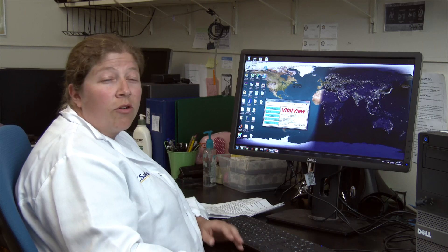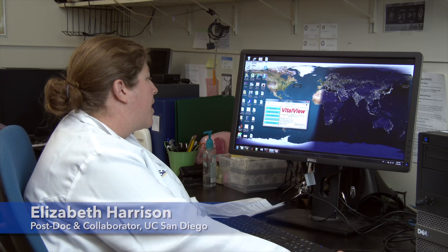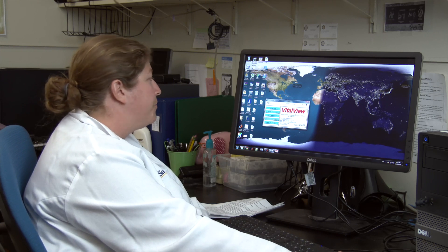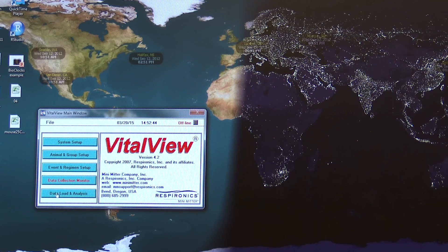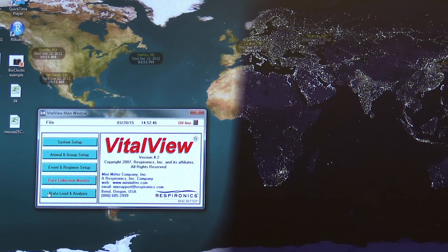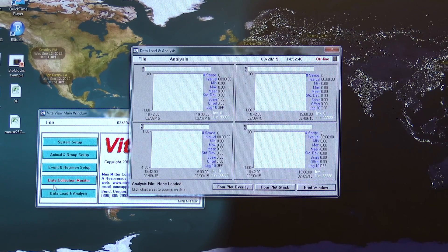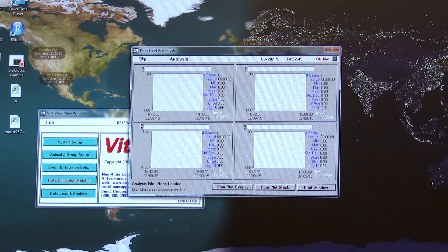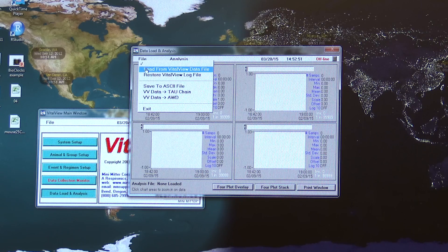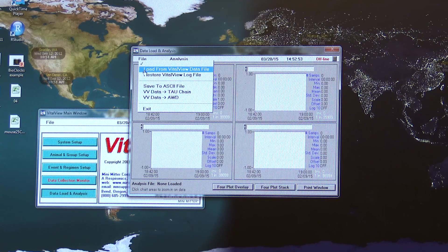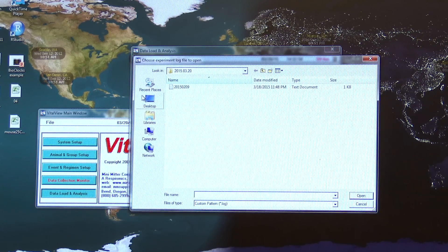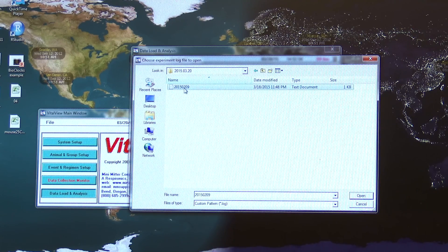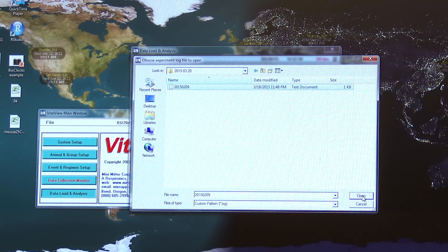In order to make an actogram of the animals' activity, first we use the program called VitalView. We go into VitalView and go into data load and analysis. From there we'll pull up a file, load from a VitalView data file that Deb pulled off the computer, and then choose an experiment file to open.